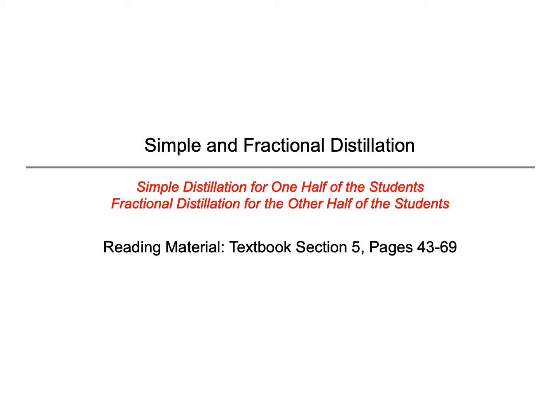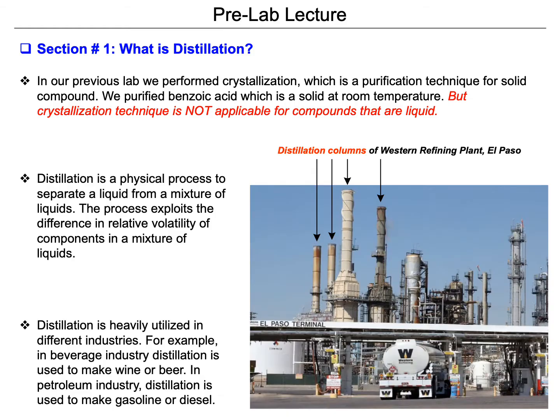Hello everyone. In this session, we are gonna explain simple and fractional distillation. As you see, in this session, we are gonna separate a mixture of liquids. In the previous session, we explained crystallization, and you know that crystallization is meant for purification of solid compounds. But here we have distillation, which is meant to separate the liquid phase.